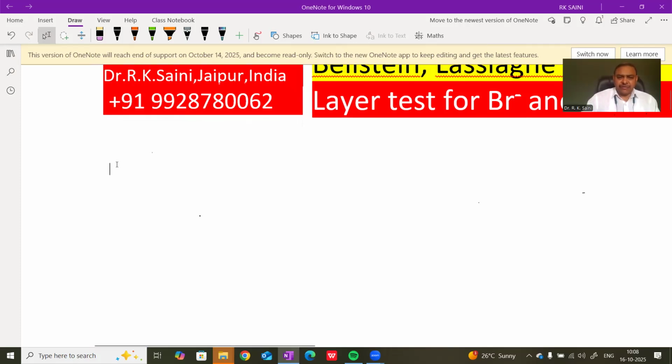First is the Beilstein test. However, this test is not a reliable or confirmatory test of halogen, because some other radicals also give the test. But in this process, we use a copper wire.